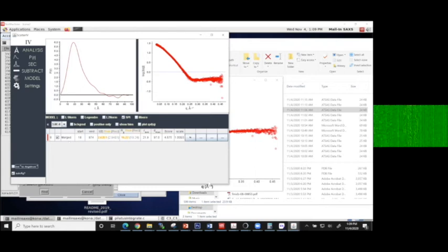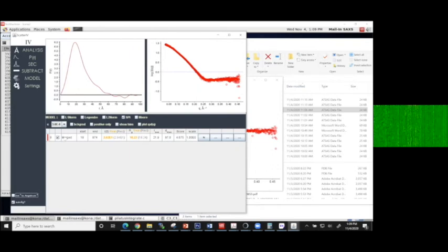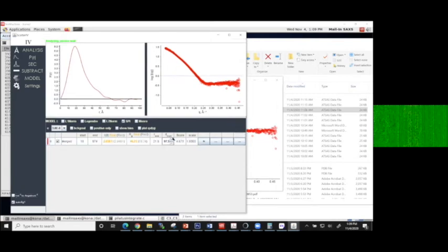Let's see, the window. And again, if there's breaking, usually a window pops up, and of course it doesn't here. Hopefully during your fresh load of this, it will, but you can also help it along. So basically you're just looking for the plot space where the P of R slides down into something close to 0. So somewhere around 65 angstroms is the maximum dimension of this particle.